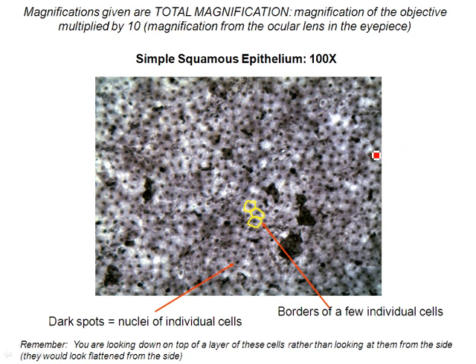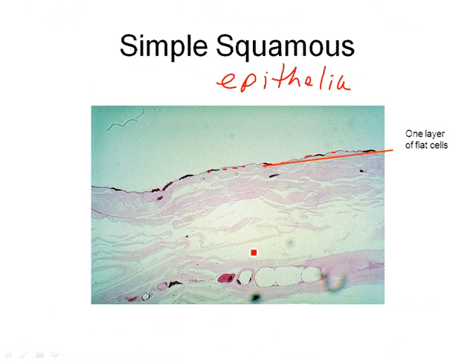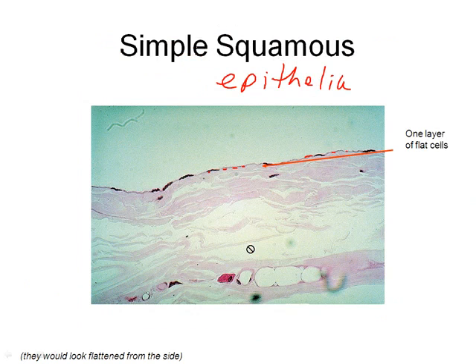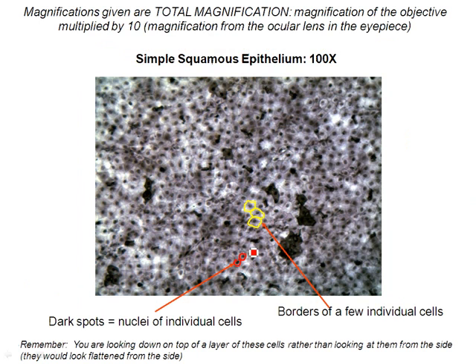And this is another one, just showing you different magnifications. This is not quite as magnified, so they look smaller. You would go back to the bigger magnification. Same thing, just get used to it. If you were here in lab at the microscope, you can make things really magnified or not so magnified. So I want to make sure you understand that it's the same thing, just maybe not as magnified.